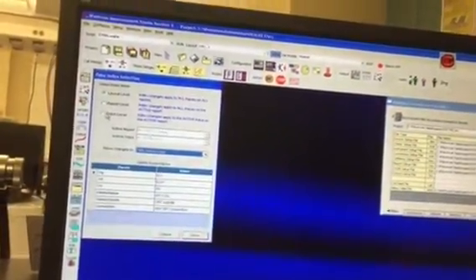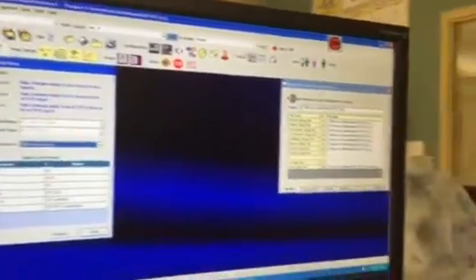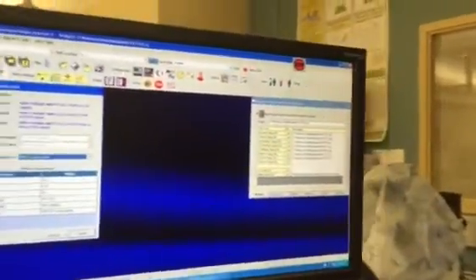The other option, the trace level one, would be that if there's multiple traces within a report, you can even control it down to that level. It gets fairly low level.